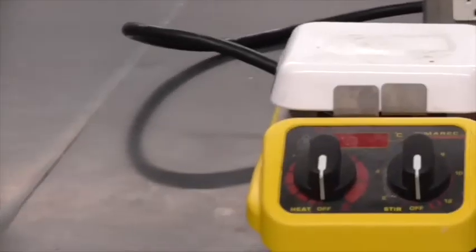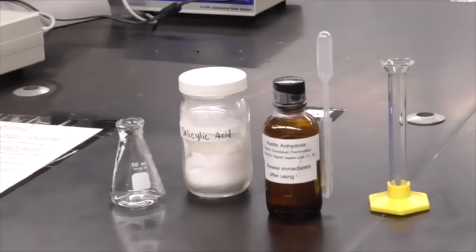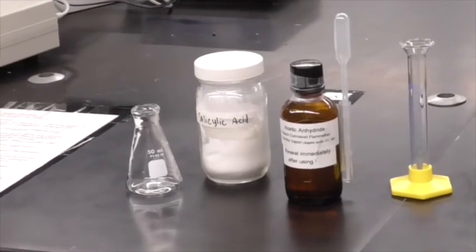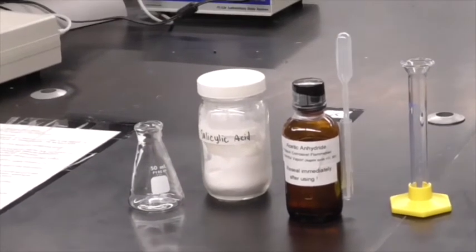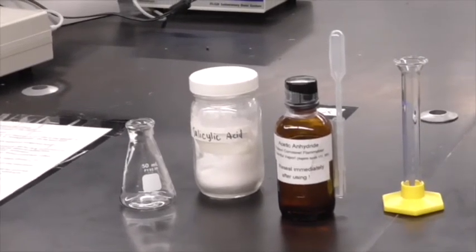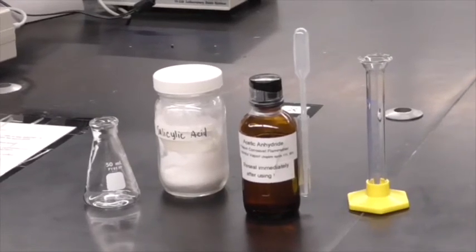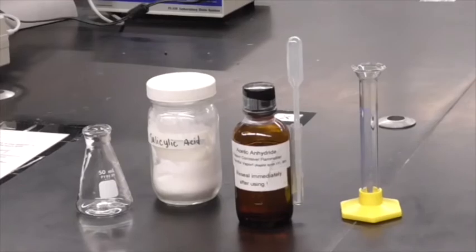One last thing about our reactants is that acetic anhydride is also very corrosive. So we're going to take care not to get that on our hands or clothes or anything like that, because it'll eat right through it. All right, so next thing we need to do is weigh about 2 grams of salicylic acid. So let's go over to the balance.